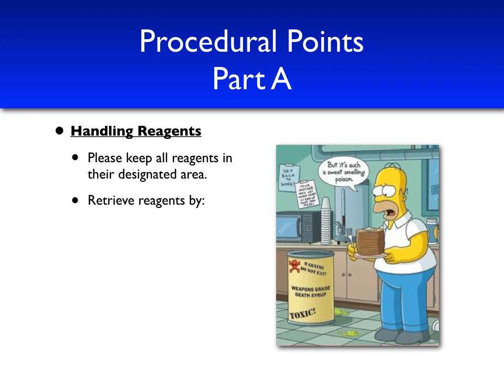Another important thing you'll note is how we obtain reagents. It's important to note that no matter what the reagent is, you never want to handle any reagents with your hands, even if you're wearing gloves. So, let's take a look at how we get reagents. For many of the metal samples, we can usually use the forceps in our lab drawers. In some cases, it might also be appropriate to just use a metal spatula.